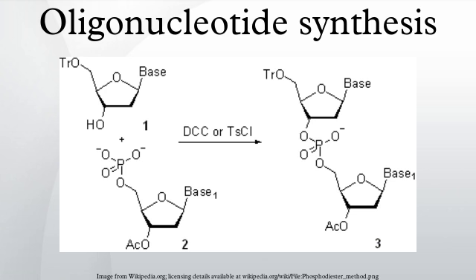It is worth remembering that conducting detritylation for an extended time or with stronger than recommended solutions of acids leads to depurination of solid support-bound oligonucleotide and thus reduces the yield of the desired full-length product. Step 2. Coupling. A 0.02–0.2 M solution of nucleoside phosphoramidite in acetonitrile is activated by a 0.2–0.7 M solution of an acidic azole catalyst: 1H-tetrazole, 2-ethylthiotetrazole, 2-benzylthiotetrazole, 4,5-dicyanoimidazole, or a number of similar compounds.